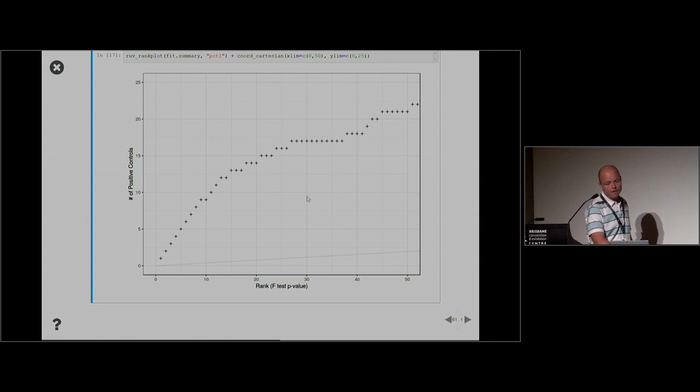This general type of plot is probably one of the most useful diagnostics that you can do after running a differential expression analysis. I can't emphasize enough, and will emphasize a lot after the break, that positive controls are very, very useful, because whenever you do any sort of analysis on real data, there are various things you need to twiddle and work out, different negative controls that you might try, different values of k that you might try, and you're always going to be a little bit in the dark in real life.